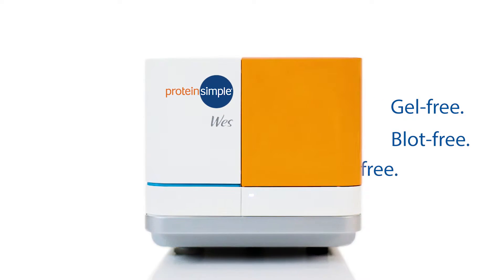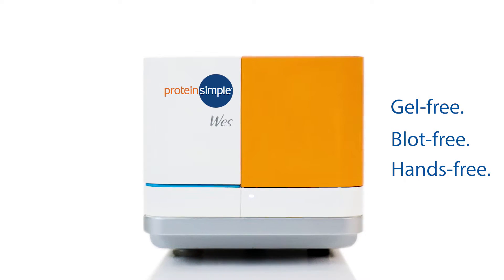He runs gel-free, blot-free and hands-free Simple Western assays in only three hours.